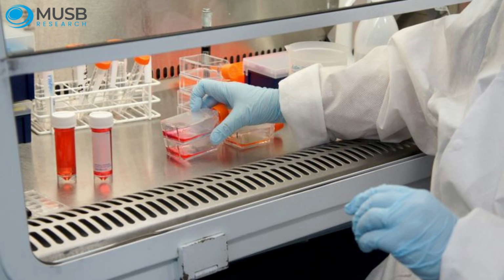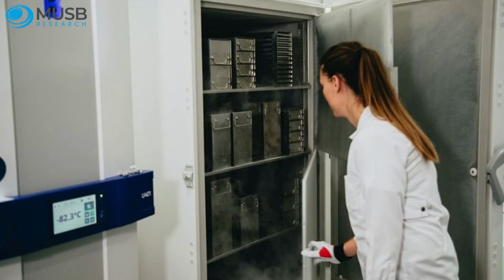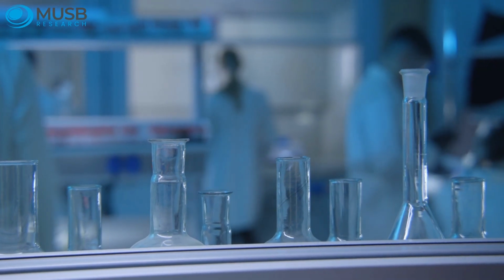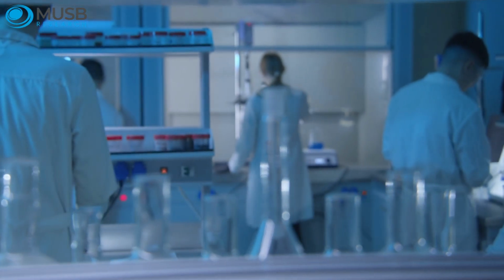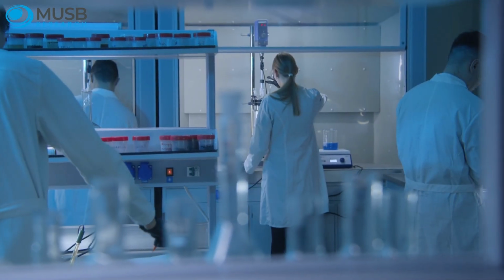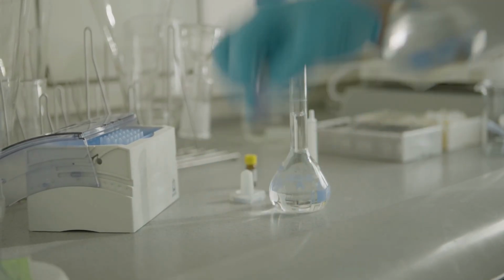For cells to grow properly, they need very specific environmental conditions. Most mammalian cells require a temperature of 37 degrees Celsius, a carbon dioxide level of about 5%, and controlled humidity. These conditions are maintained using a specialized incubator. Equally important is sterility. Even minor contamination can affect cell health and compromise experimental results, so maintaining a clean environment is critical.